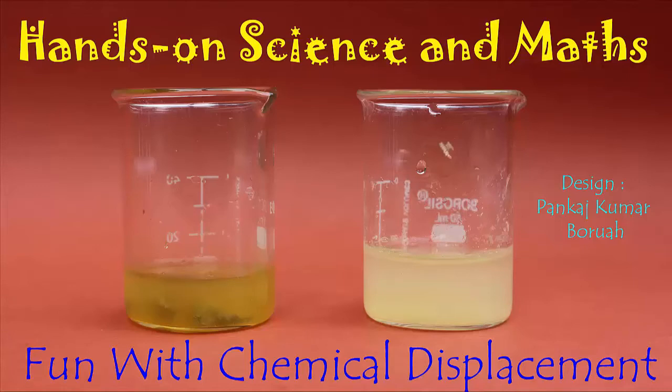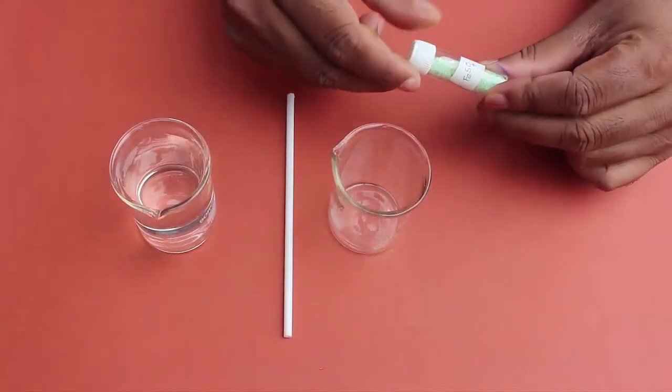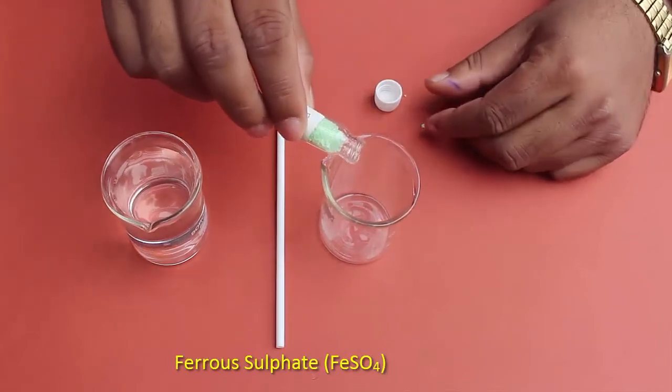First, we will make a solution of ferrous sulfate. For this, place a few crystals of ferrous sulfate in an empty beaker.